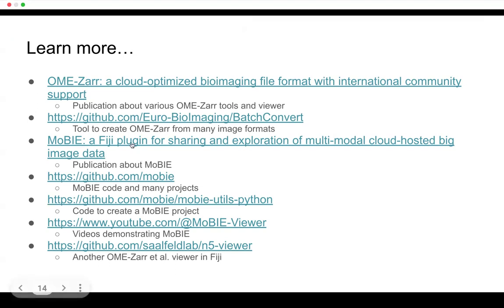Then if you want to learn more about MoBIE, you could read the MoBIE publication or you explore the GitHub organization where we have all the code and also many projects. So you can open all these projects in Fiji, look at them and also maybe look at how a MoBIE project internally looks like with all these dataset JSON files. If you want to create yourself a MoBIE project, please go to the MoBIE Utils Python. It's a Python library that allows you to create actually OME-ZAR images and then also all the metadata that you would need for a MoBIE project. Then if you want to see more videos about how all of this works as sort of live demo, you can go to this YouTube channel. And then I think actually just last week was a new release from the Saalfeld lab in Janelia of the N5 viewer. So they have now also much better OME-ZAR support. And I think it's definitely worth checking out what they can offer there. It's a Fiji, you don't even have to install it. It just comes with Fiji. So it also might be very interesting.